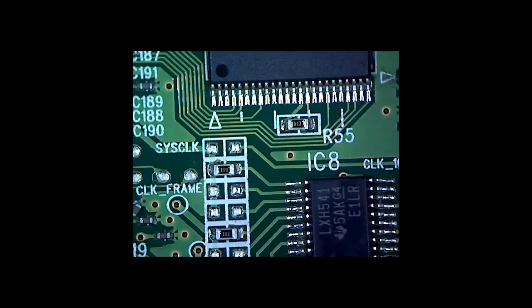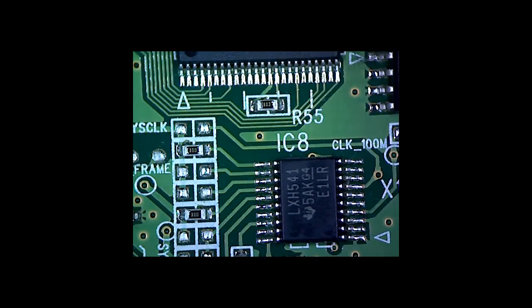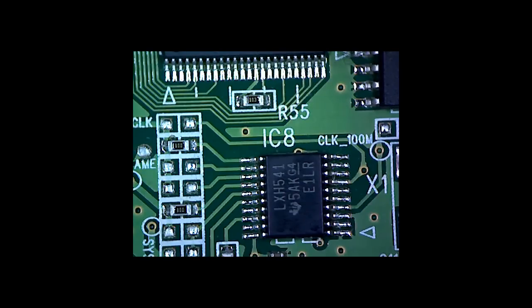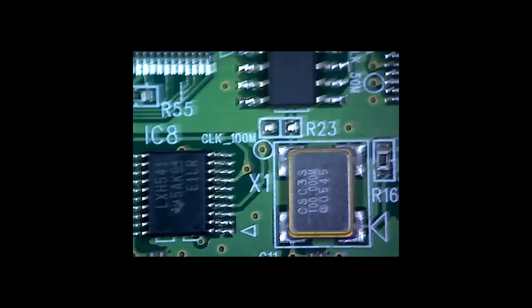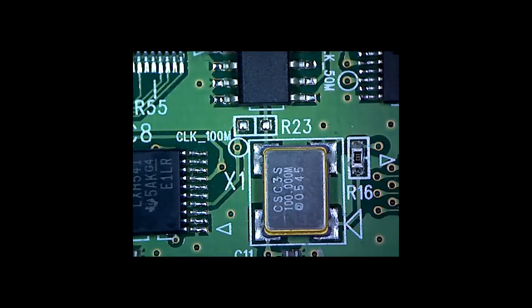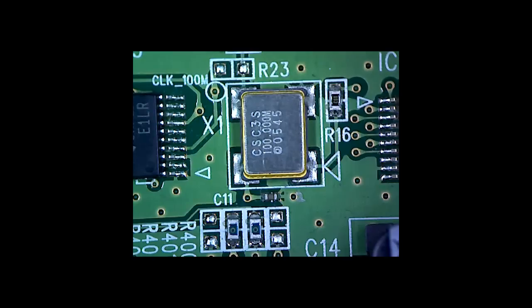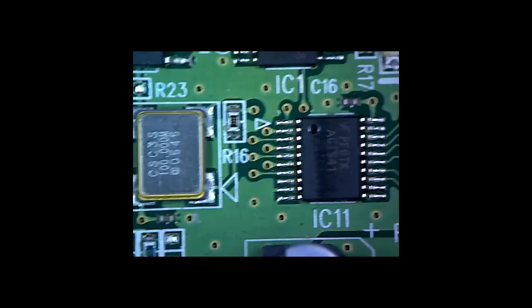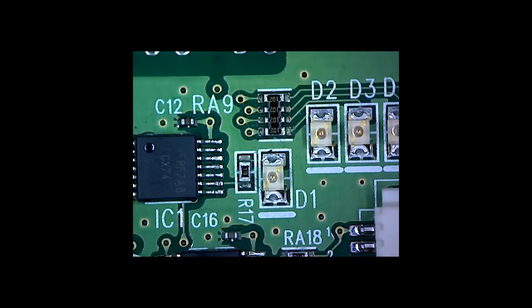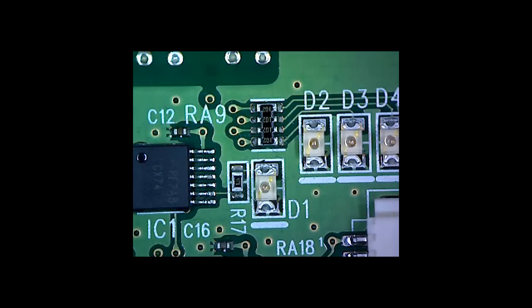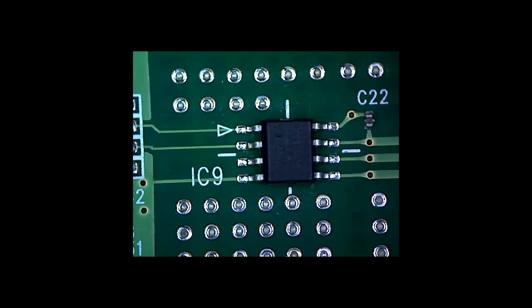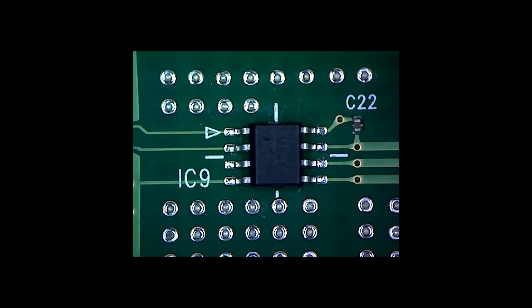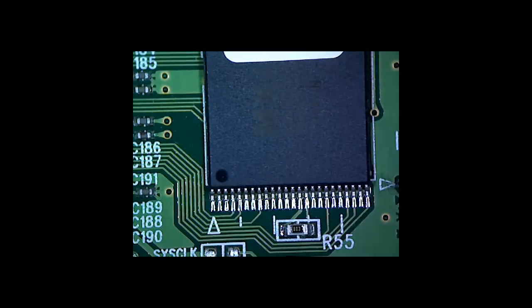I don't know what the professional software version gives you over this. The camera is only 1.3 megapixels which isn't much these days, but if it was any higher then you're going to need an even faster PC to give you the frame rate if you want to work on anything live and look at the screen. So yeah, I guess it's a compromise between what you want to do with this. For me it's recording videos, probably for the forum. I don't need to look at it on screen, I just would like it to be very clear for you guys.